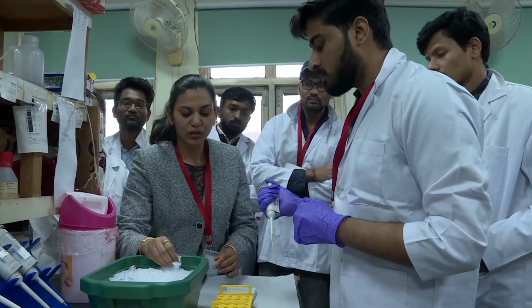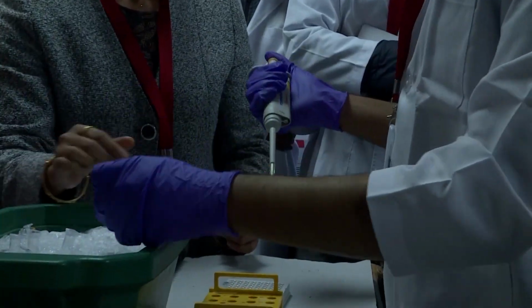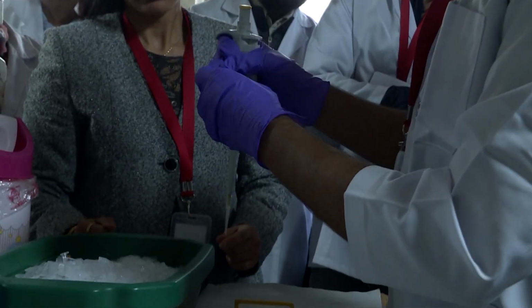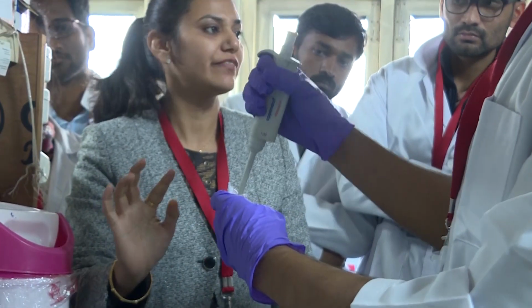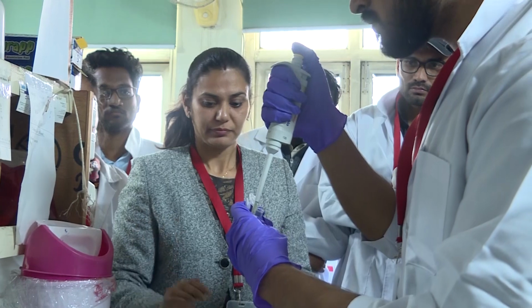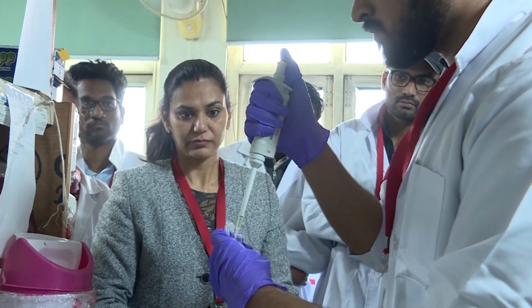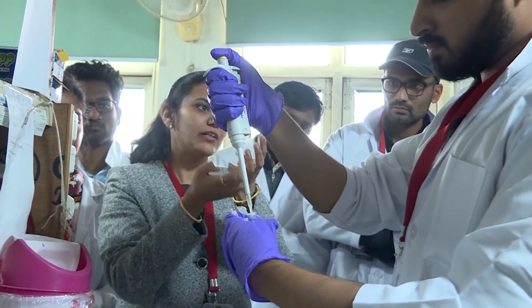Take 80 microliter of this SYBR in this tube. Be careful, your tips should not touch anywhere else. Always try to put it at the bottom of your tube.